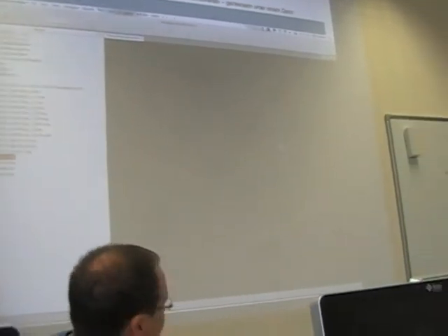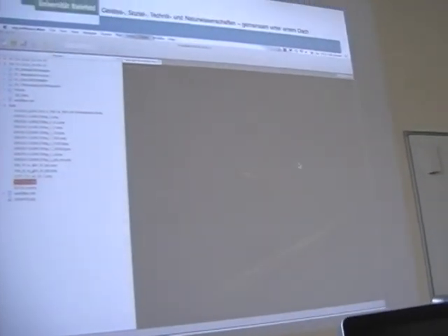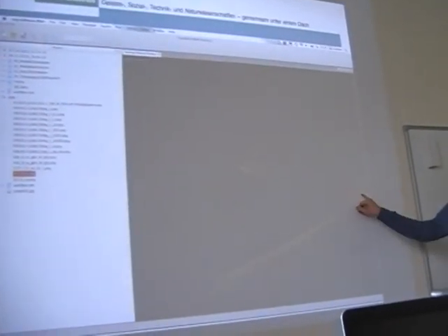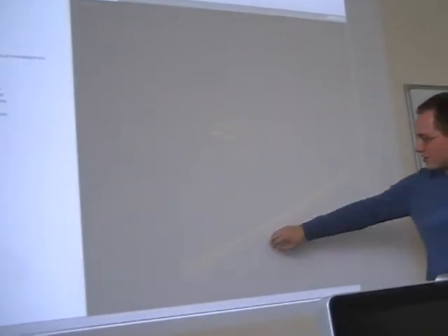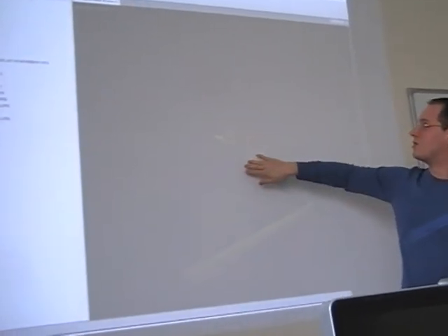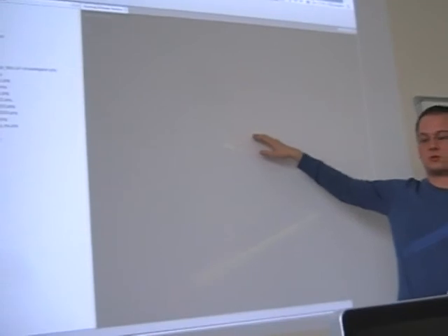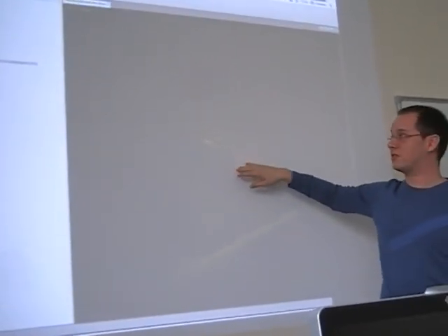And finally, there's a neat view, which is not really visible on this viewer. Just a second. So the program allows to compare two-dimensional chromatograms, and what you should see here are some yellow ridges and some red and green. This is after aligning two different chromatograms to each other and shows a differential visualization in 3 dimensions.